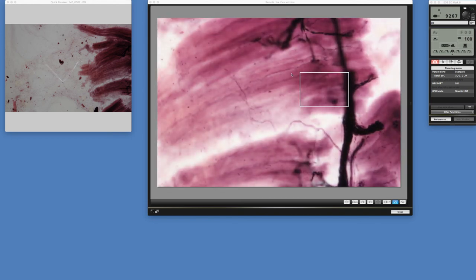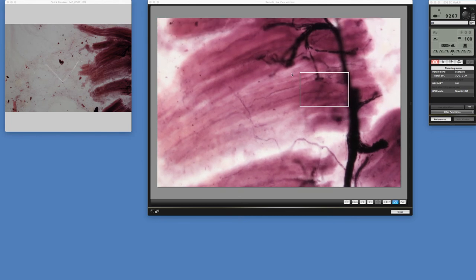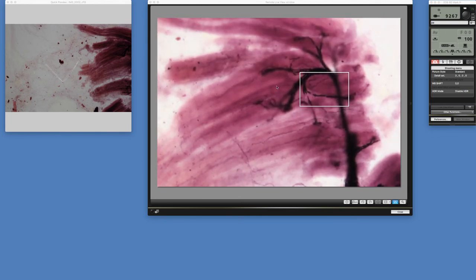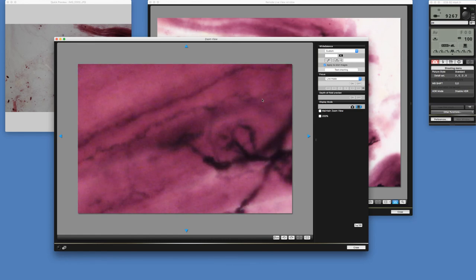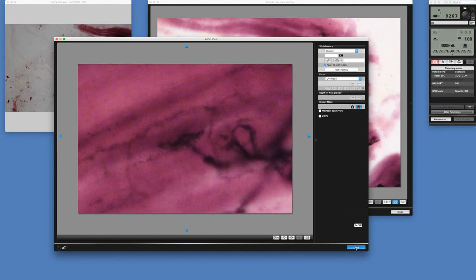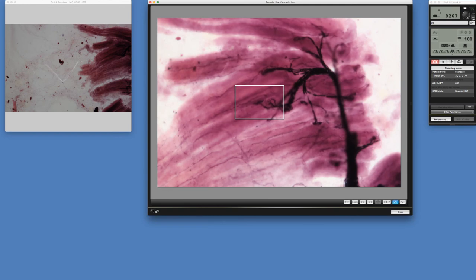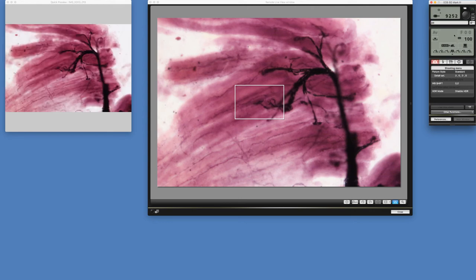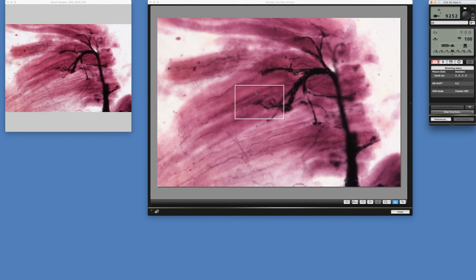This is the 20x objective. Here we can see a nice neuromuscular junction, so I'll expand that and focus on the sample there, then close this and take a photograph. It turns out it's a very slow shutter speed in this case — 2.5 seconds — which isn't a big deal here because our sample is fixed and motionless. But if we had critters running around from a plankton sample, we would want a faster shutter speed. To do that, we would increase the light source so that we could have a faster shutter.